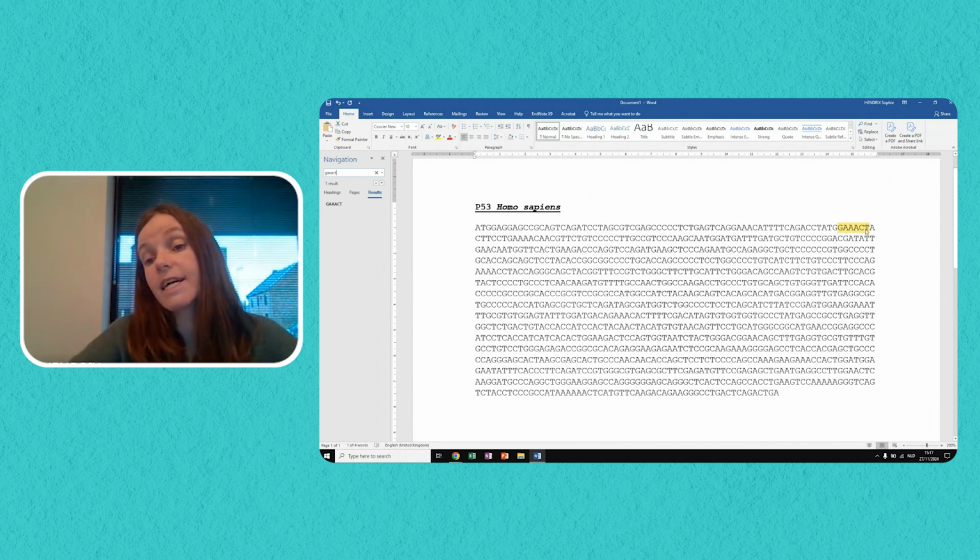So this was the last part of the second exon. So this means that this T nucleotide here is the last nucleotide of the second exon. And of course, this means that the subsequent A is the first nucleotide of the next exon, so exon number 3.